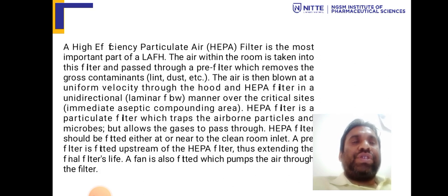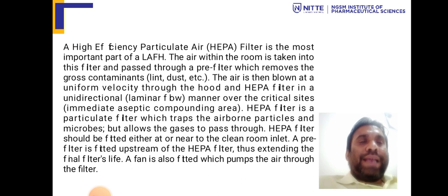Now, a high efficiency particulate air filter is the most important part of LAFH. The air within the room is taken in by the filter, passed through the pre-filter, which removes the gross contamination, lint, dust, etc. The air is then blown at a uniform velocity through the hood and HEPA filter in a unidirectional laminar airflow manner over the critical sites, the immediate aseptic compounding area. A HEPA filter is a particular filter which traps the airborne particles and microbes but allows the gases to pass through.